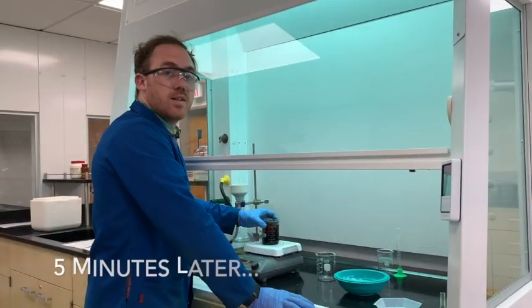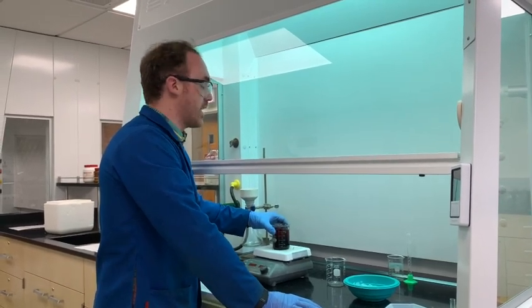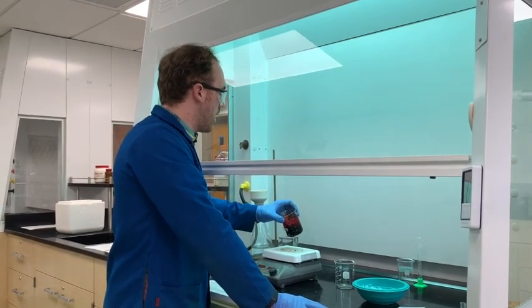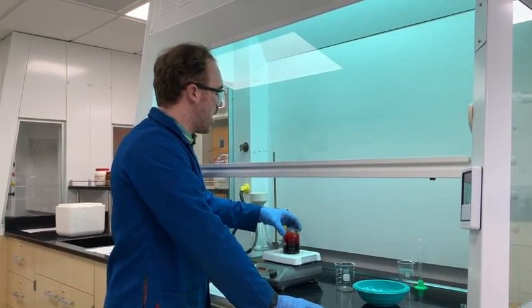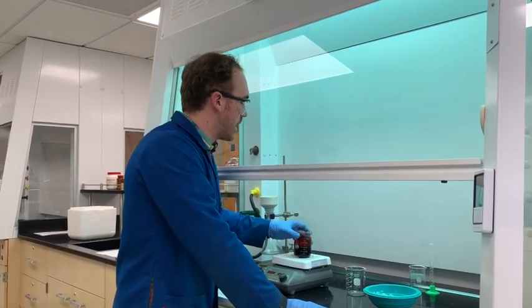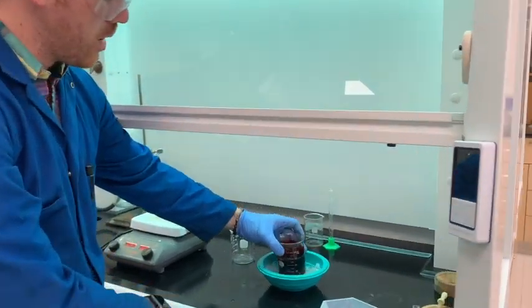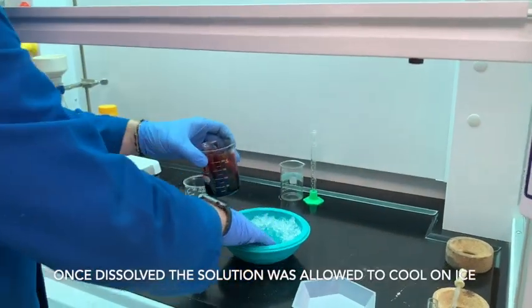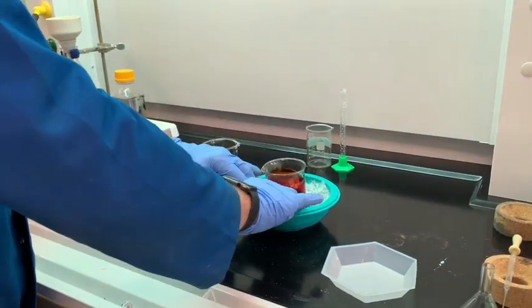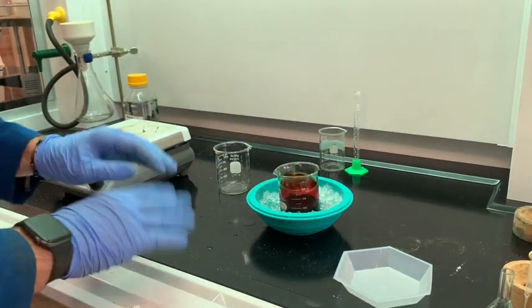So it started simmering and bubbling a little bit, and it's pretty opaque. It's quite dark. So I'm probably not going to worry about making sure it fully dissolves here. It's just impossible to see anyways. So what I'm going to do is take this hot solution and put it on this ice bath and allow it to cool. That's going to allow this to precipitate, and hopefully most of it will fall out of solution, and that will leave us with as much product as possible for the filtration step.